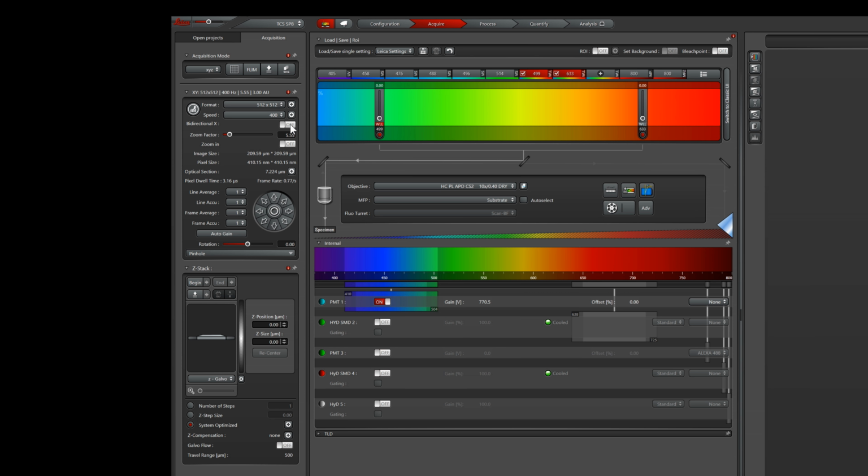Since there is no way for you to calibrate this setting except to visually inspect carefully the resulting images, either avoid using it or make sure the slider is in the right position, as previous users' adjustments to it will remain active. Another very important setting is the zoom factor, which will directly change your pixel size.